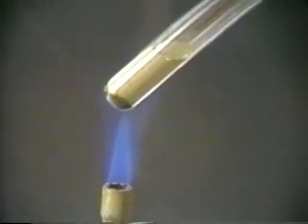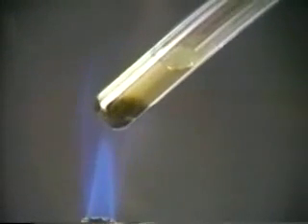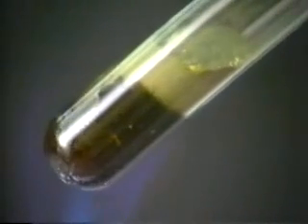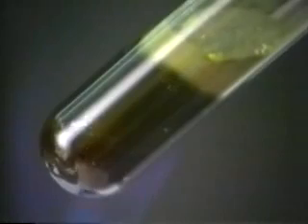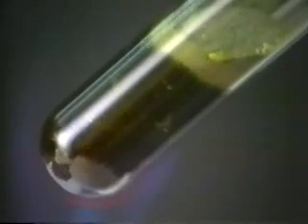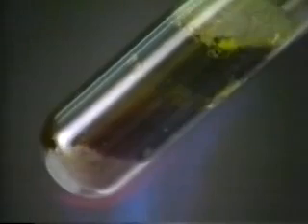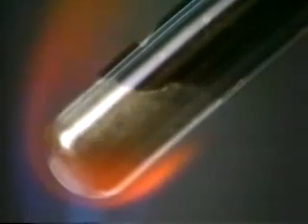When the same mixture is heated in a test tube, the two elements, iron and sulfur, react together to form a new compound, iron sulfide. At first, when the mixture is heated, the sulfur melts. Eventually, as the heating continues, the iron and sulfur begin to react together.